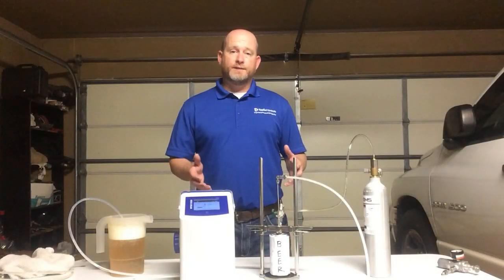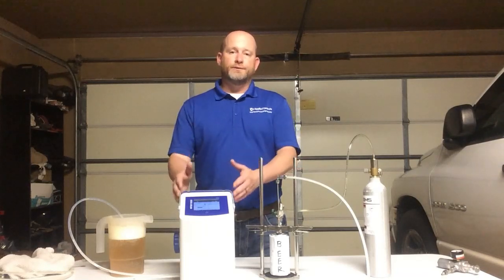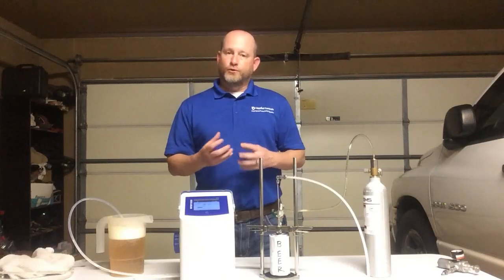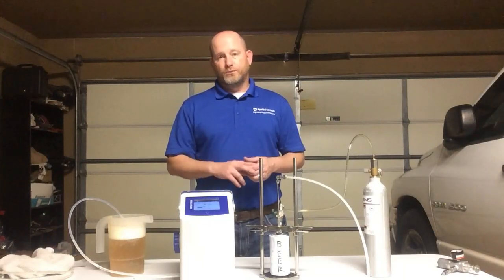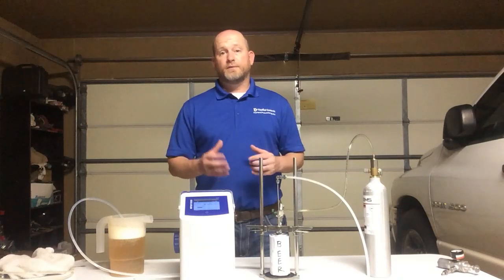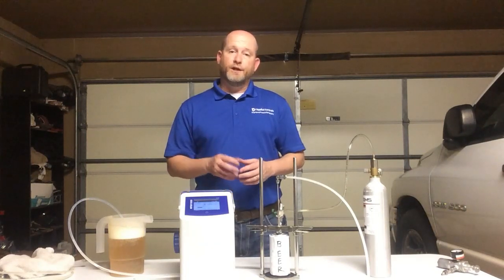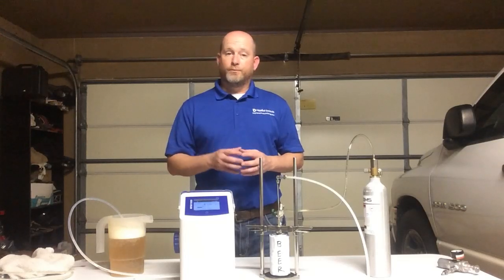So we finished testing 4 beer cans. Again, the first 2 we let go through to let the internals of the DO meter get to that temperature, the normal temperature. They both still went down to 2 ppb. The next 2 we tested went down to 2 ppb. So it's pretty safe to say that that case that I bought, they're all within that spec that they like. And again, this has a plus or minus accuracy of 2 ppb. So very accurate machine will help you improve the quality of your beer.